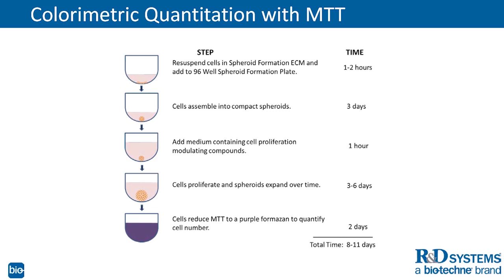And this is important because we've looked at several of the other colorimetric methods where the cells produce a soluble product like MTS and WST, and we've seen a lot more noise, a lot more variability in the readings. And we believe what's happening is that these spheroids are of sufficient size that they're interfering with the absorbance readings through the wells. So using this MTT assay and actually solubilizing the cells with these formazan crystals is giving us the best, most reproducible data possible.